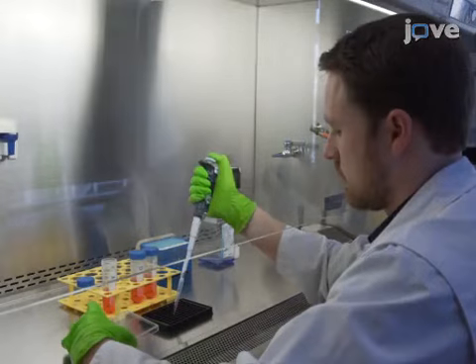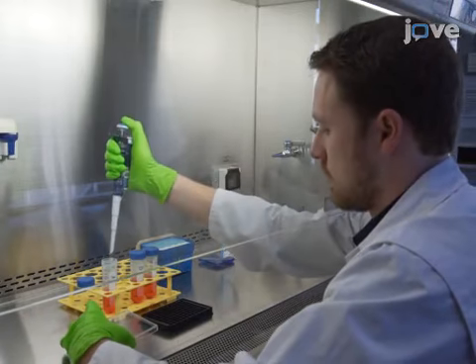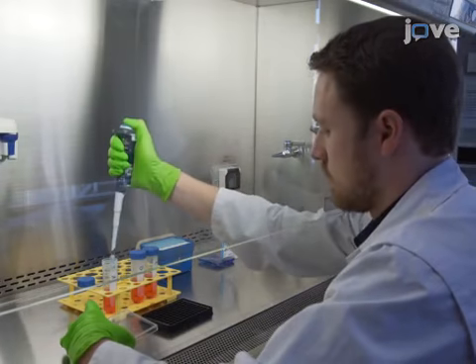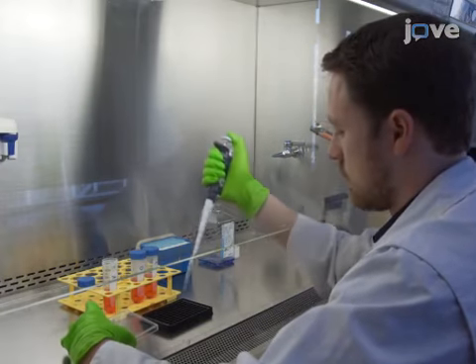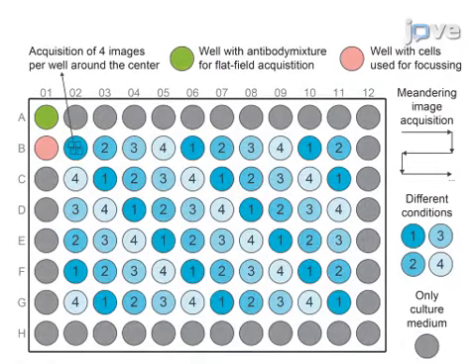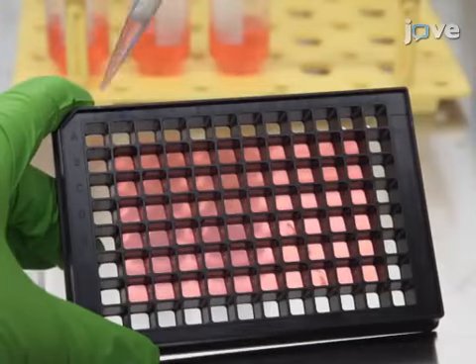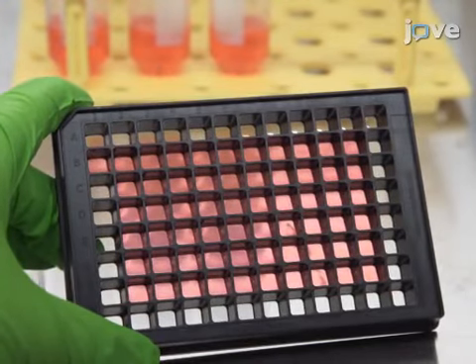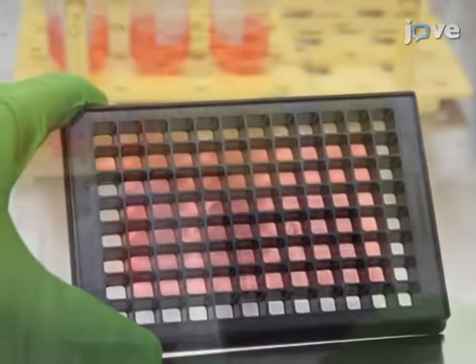To start the procedure, seed 8 to 10,000 human dermal fibroblasts in 60 inner wells of a black 96-well plate with a thin continuous polystyrene or glass bottom. When using different conditions, treatments, or cell lines, distribute their seeding locations homogeneously on the plate to minimize the plate effects. Then, seed a further 8 to 10,000 cells in well B01 to be used for focus adjustment.